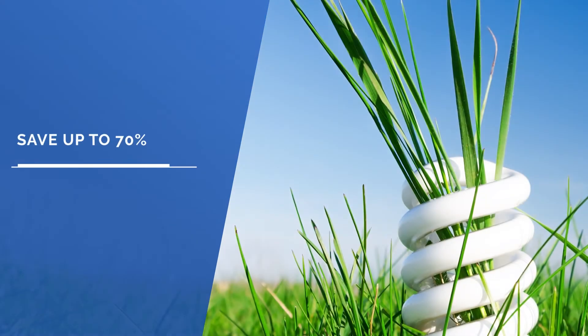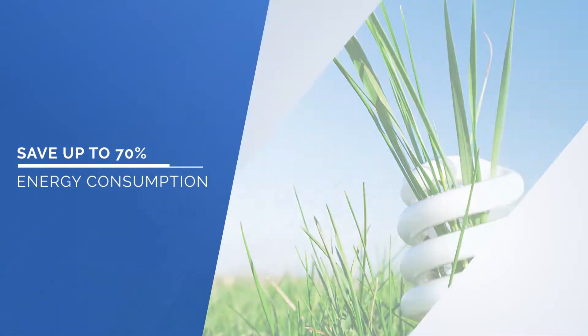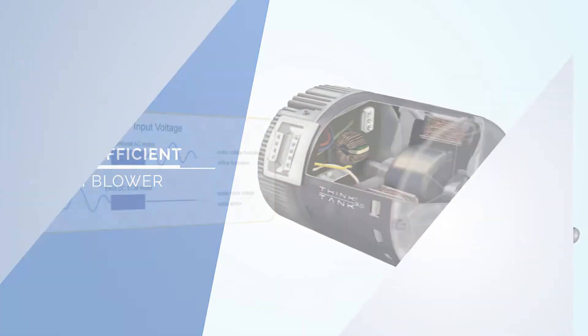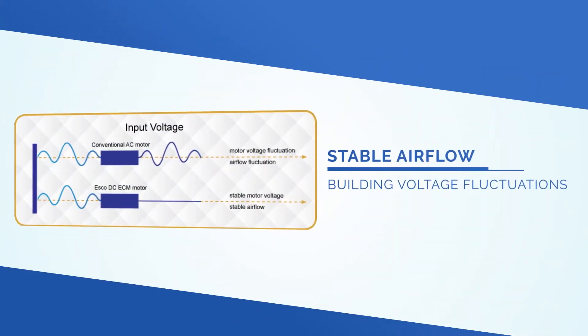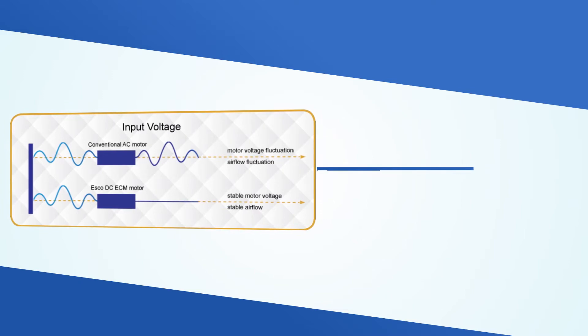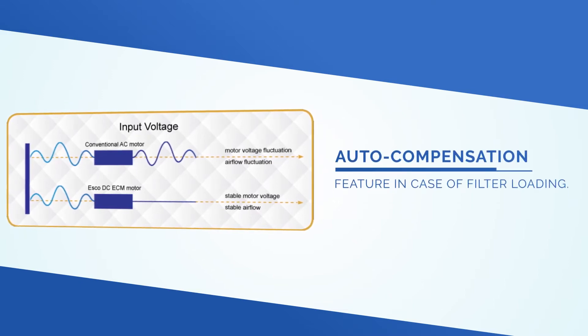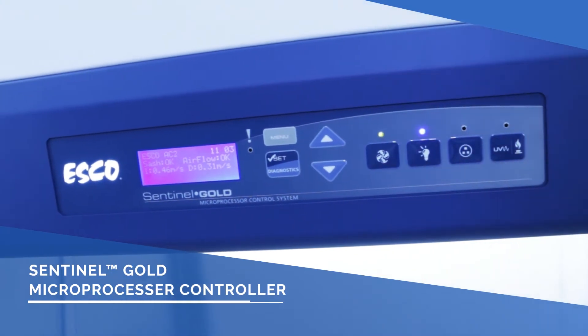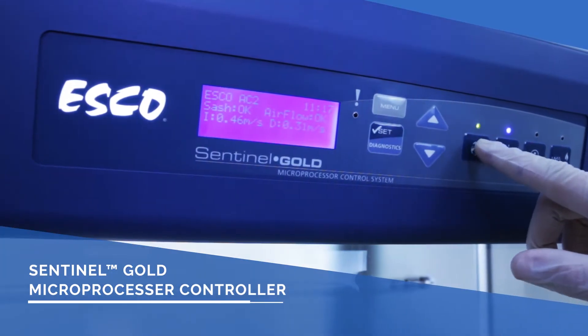Save up to 70% of your energy consumption with the energy-efficient DC ECM Blower, which also provides stable airflow despite building voltage fluctuations and auto-compensation in case of filter loading. The Sentinel Gold Microprocessor Controller comprehensively displays all safety information in one screen.